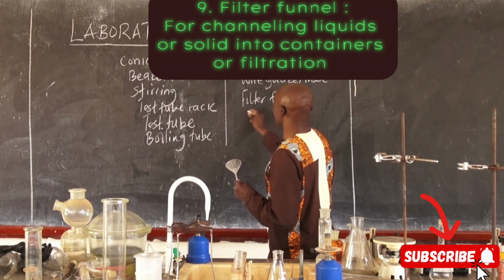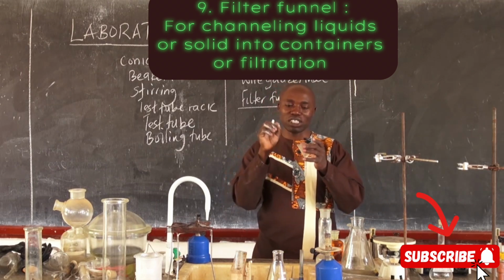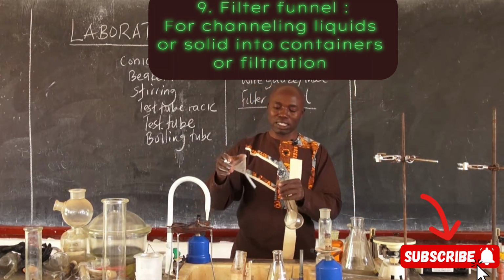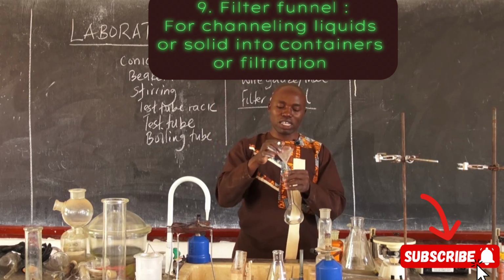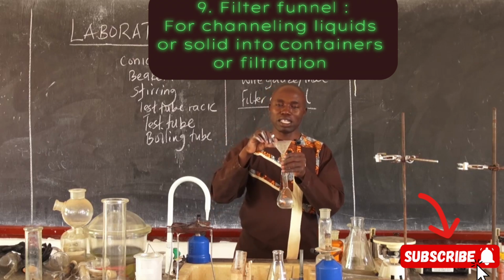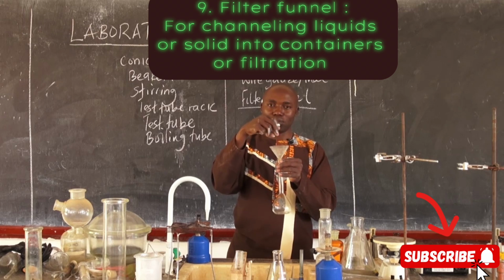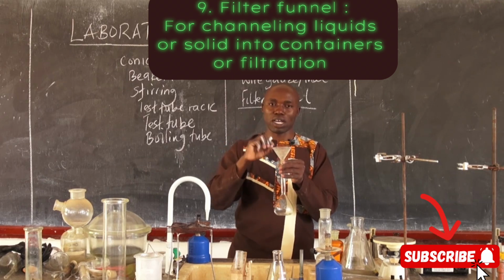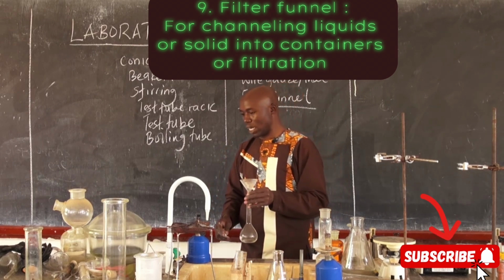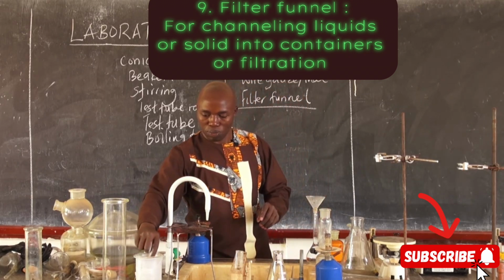Funnels come in various types, but in our laboratory we commonly use the filter funnel. It's normally used for channeling either liquids or solids through small openings of other apparatus. So I can use it to channel. If I wanted to dilute a liquid without spilling in this kind of a flask, I just place there my filter funnel. Then I either pour a liquid or I can pour a powdered solid substance to channel it down inside here. So I can use something to explain that. Let me demonstrate that, how we use a funnel.